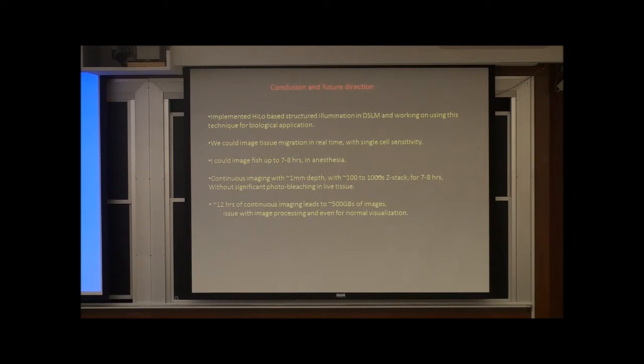And with 100 to 1000 z-stacks, because photobleaching is very low, for several hours without significant photobleaching, which is a big issue in this kind of case, it is a big advantage. And this kind of imaging can generate a lot of data, and ultimately one has to do the image processing and segmentation to get information out.